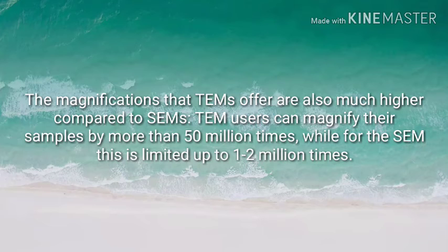The magnification that TEM offers is much higher compared to SEM. TEM users can magnify their sample by more than 50 million times, while for the SEM, this is limited to 1 to 2 million times.